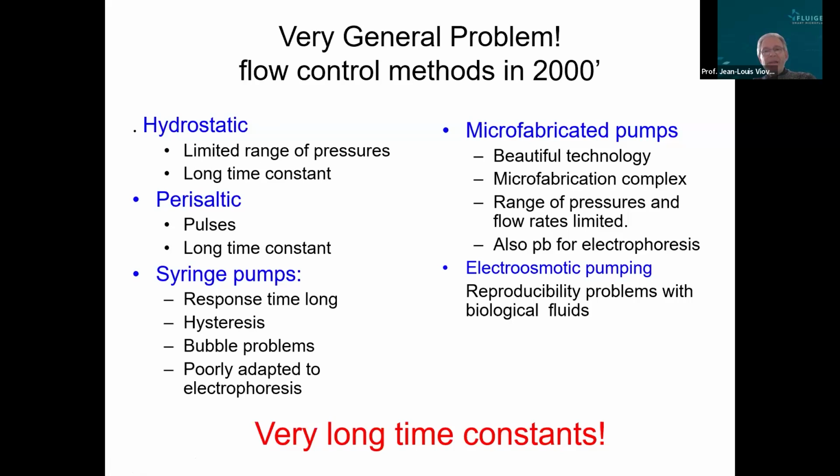All these different systems, except the microfabricated pumps, which have other drawbacks, on which I think Bruno will come again later on, had very long time constants.